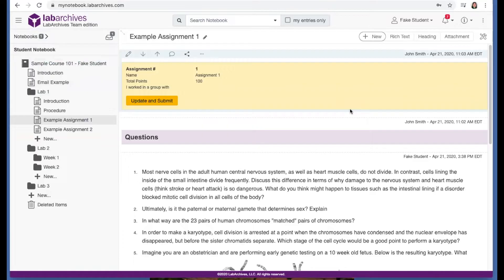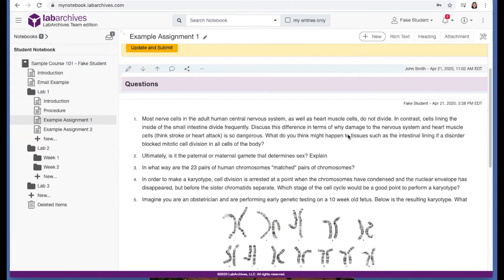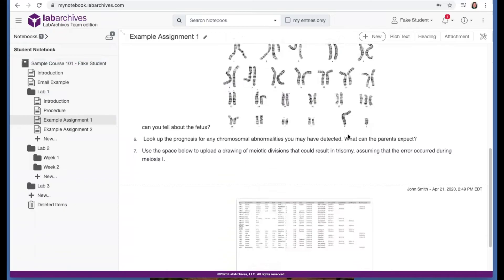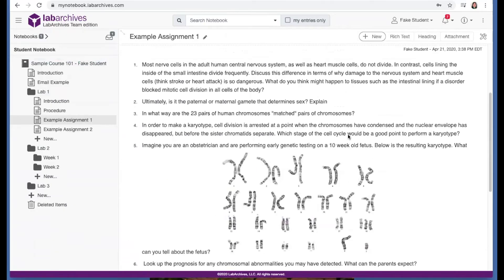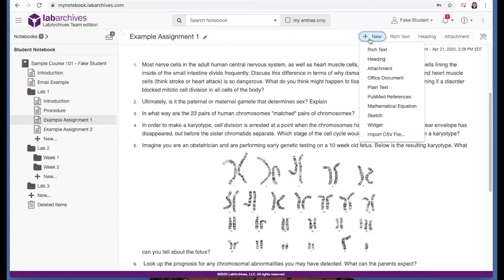Data in LabArchives is organized as entries on a page. You can add entries to this page by selecting this plus new button at the top right. This shows all the entry types you can add to this page.